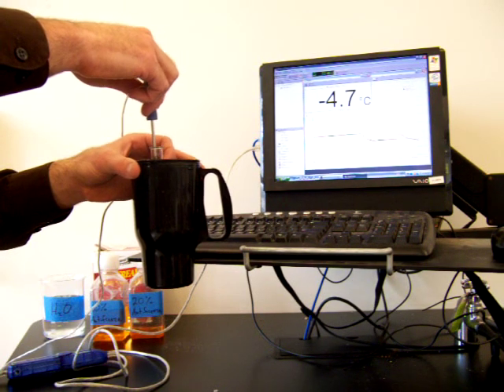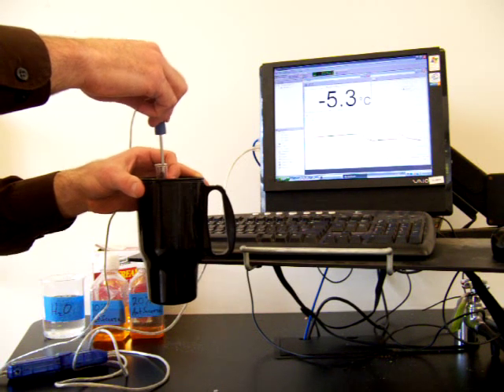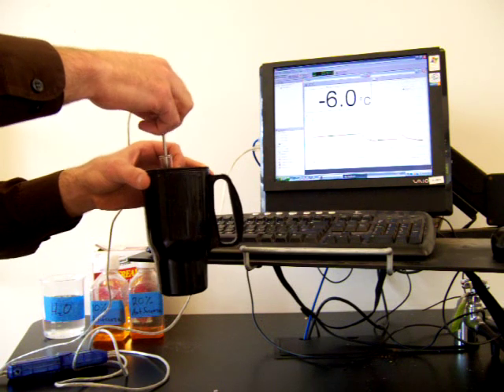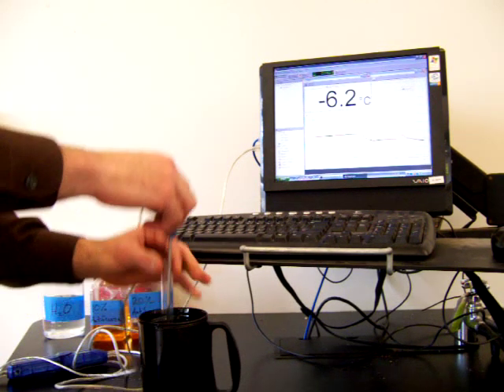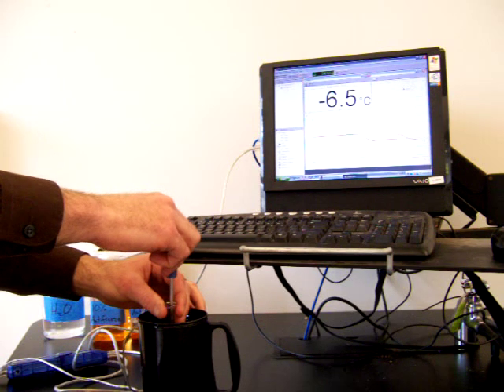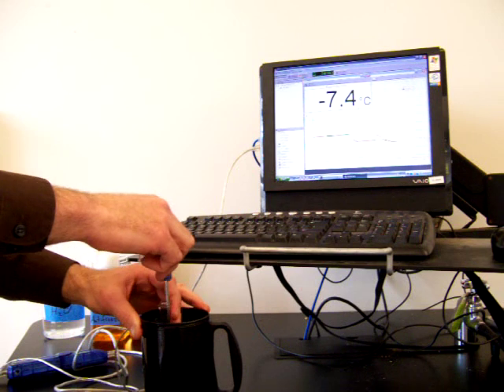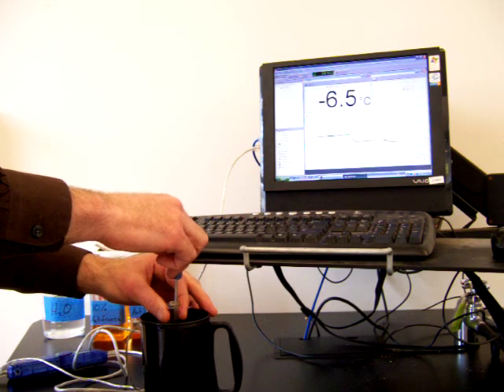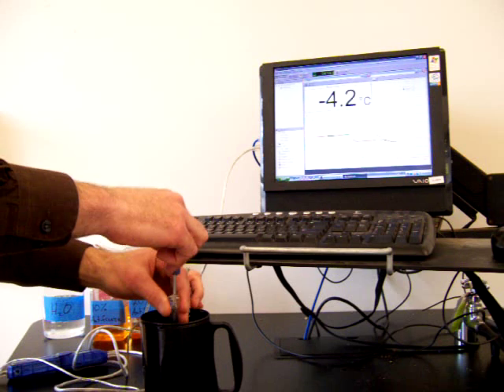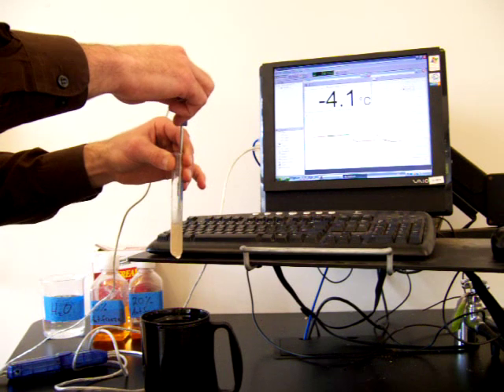We're at negative 4, negative 5. We'll take a look at it and see if ice crystals have formed yet. So we're not quite to the freezing point yet. Still dropping in temperature. And now it just came up. And so when it comes up and kind of stabilizes, that's when the ice is forming.